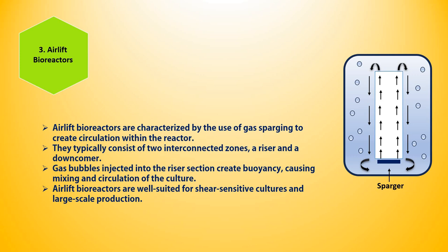So in which cases is sparger-based circulation used, that is, the air-lift reactors? This is specifically used where shear sensitive cultures are utilized for the bioreaction. Shear sensitive means, particularly, fungal pathogens where mycelial forms are present. So you all know the fungal hypha produces the mycelial mat.